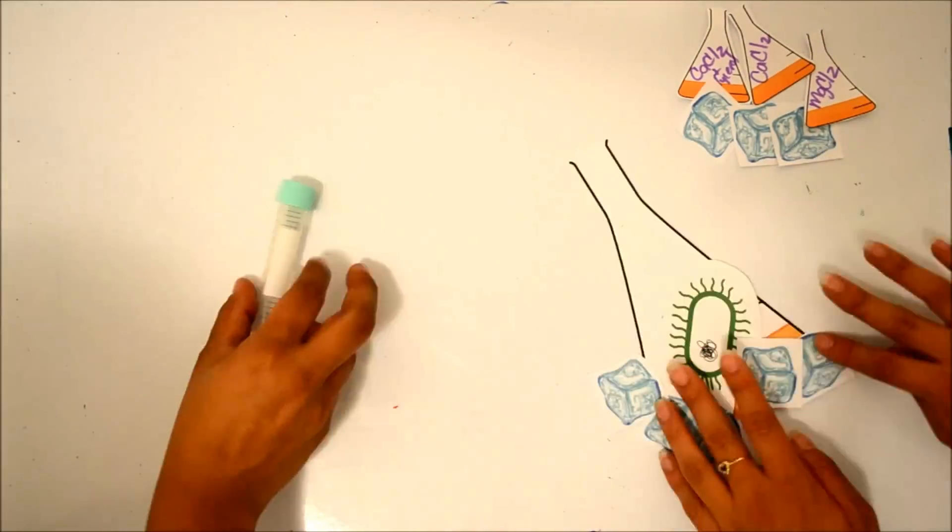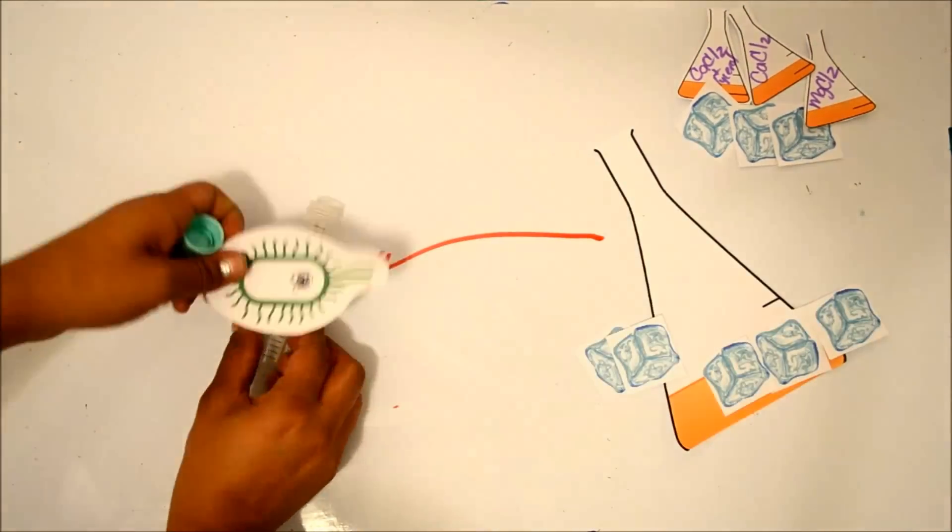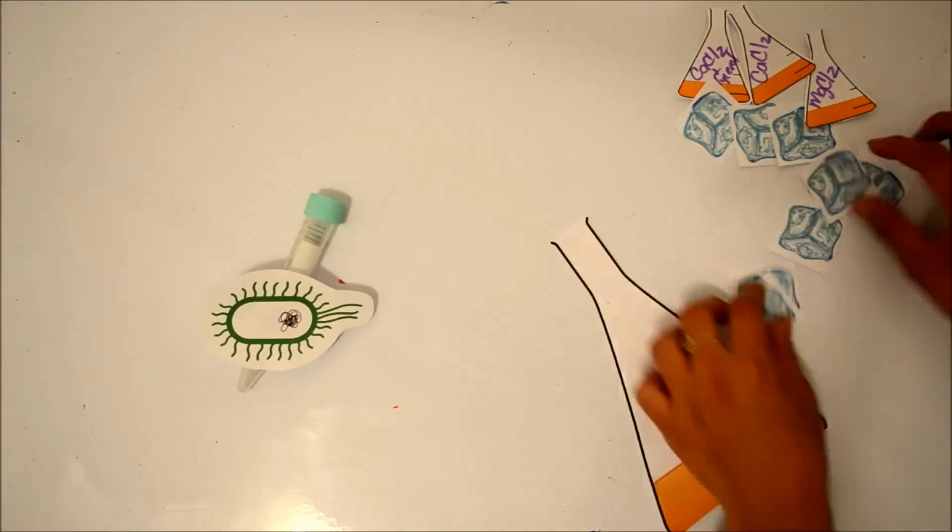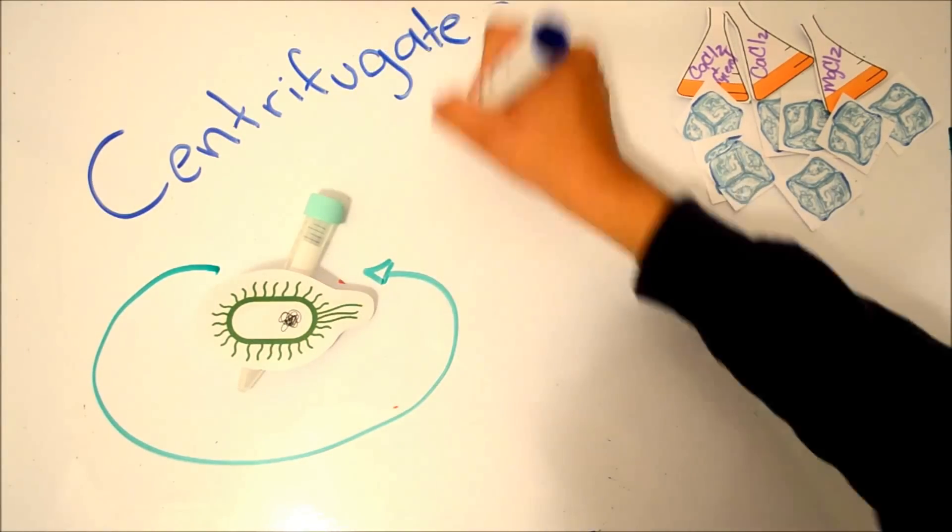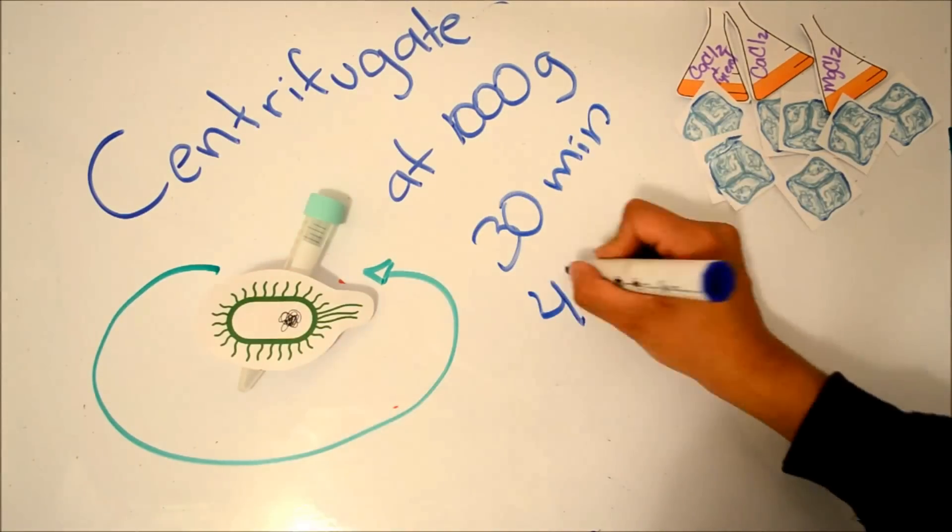Put the medium in a falcon tube. Centrifuge at 1000 g at 4 degrees for 30 minutes. Decant the supernatant.